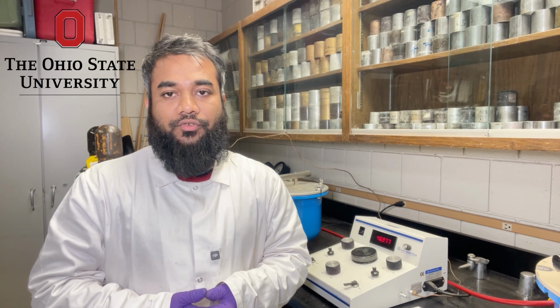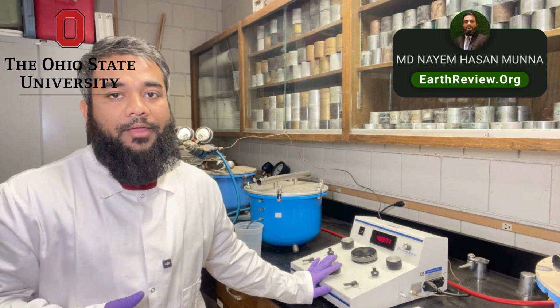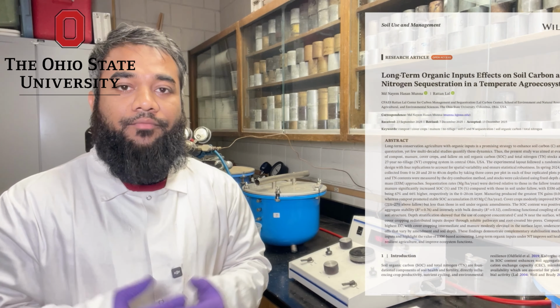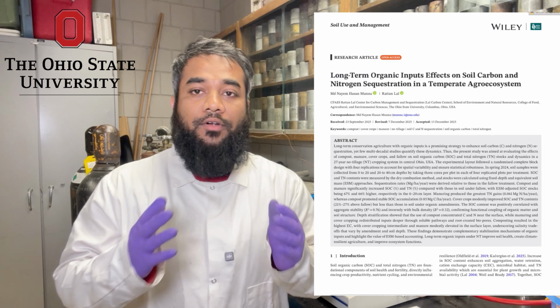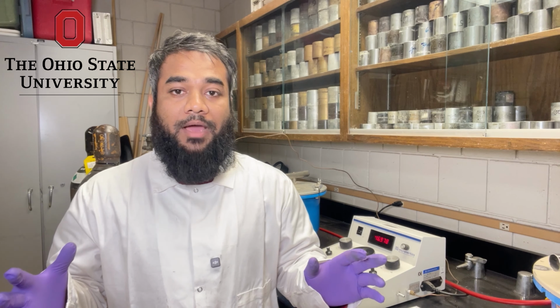Today, I'll demonstrate how we measure soil porosity using a digital pycnometer. This method allows us to determine particle density, which is a key parameter for calculating total soil porosity. Why does porosity matter? Let's talk about it.